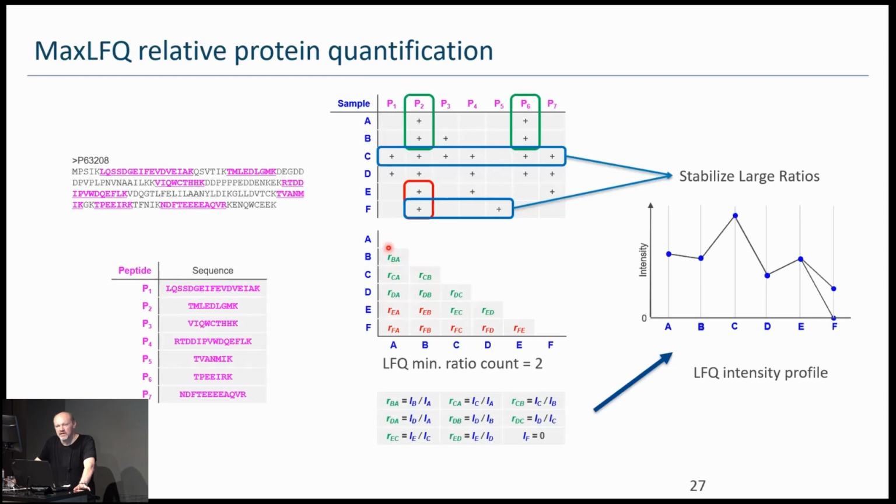And this is where you can do even better with DIA, because now, to calculate one of these ratios, you don't only split between the different peptides of the protein. For each peptide, you can take the precursor intensity, and you can also consider the fragment intensities separately, right? You can do it once for B5, then for Y7, and each of them will give you an independent ratio. Then you can put all of these ratios, which is now an order of magnitude more ratios than you had in DDA, into the median calculation, and by this it becomes more accurate, right? So that's the basic idea of MaxLFQ applied to DIA data.